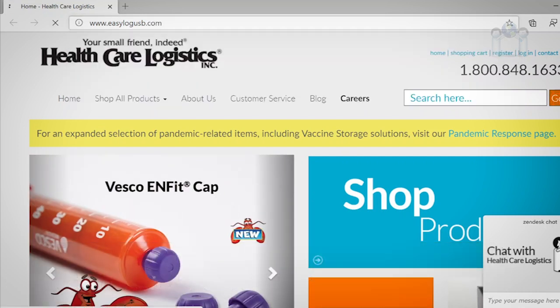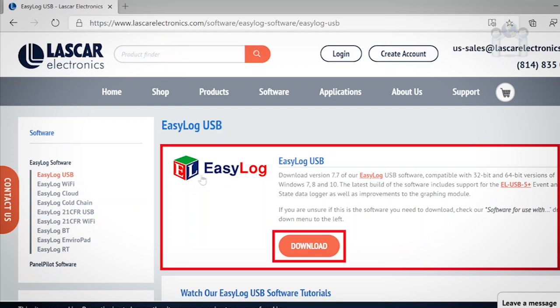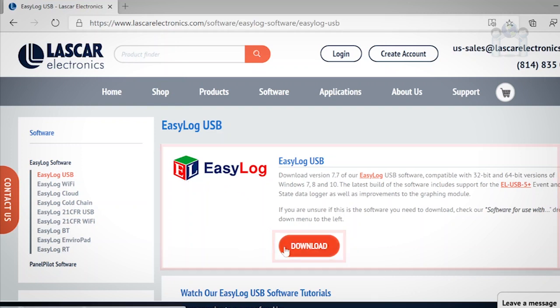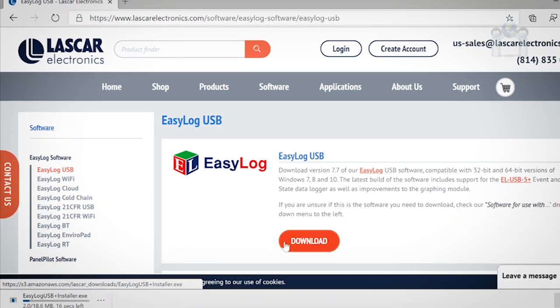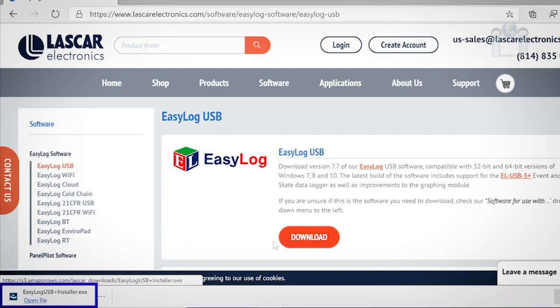At the top of the page, you will see the EasyLog USB software box and a download button. Click on the download button and a small box should appear showing the name of the download file and the progress. When the download is complete, click on Open File.